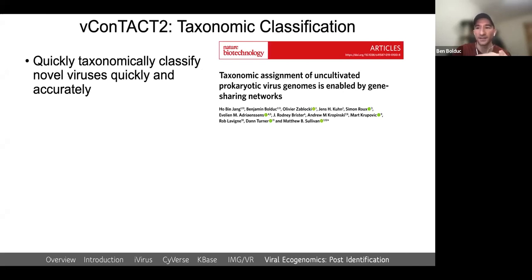And if you wanted to look at the distribution of a particular plant virus in a crop, you could grab a bunch of samples, process them, look at particular genes, and of course, you'll be able to identify your virus of interest. But you can't necessarily do that in a totally novel environment, a novel situation.